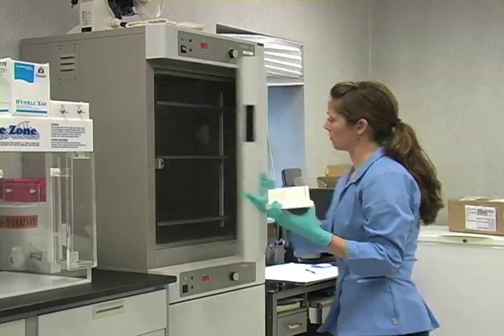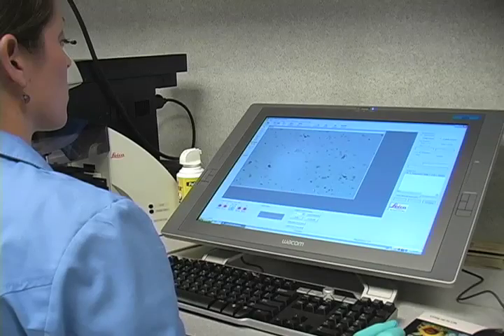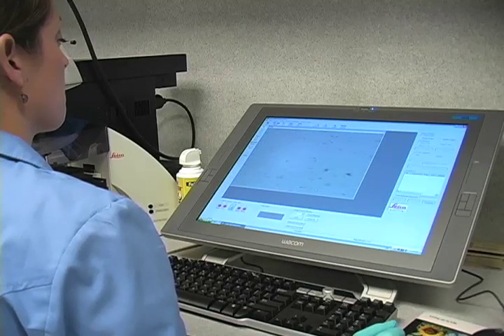And then what we'll do from there is we can actually look on a slide. We can make a slide and look for actual sperm heads.